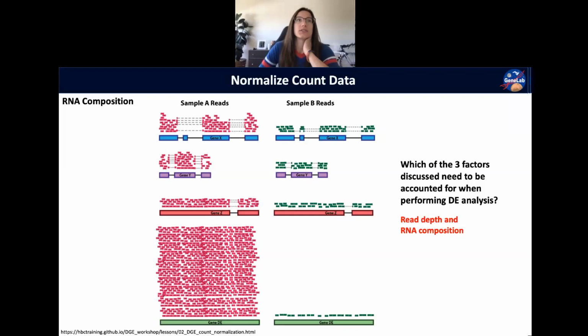So that's kind of how you account for your composition of RNA without actually knowing exactly what the contaminants could be. And Lauren's going to talk more about how that's done in the context of different statistics used for the tool that we use to do this normalization. So she'll get into that a little bit more, and hopefully that'll clear things up.